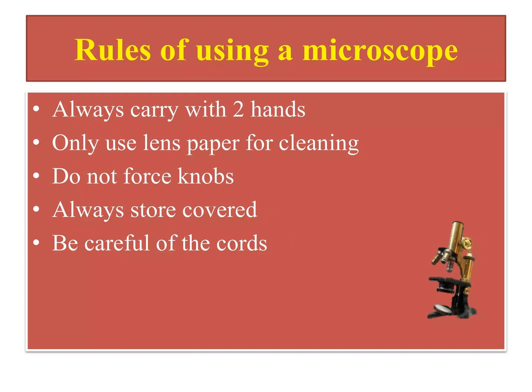Rules for using a microscope. Always carry it with two hands. Only use lens paper for cleaning the lens. Do not force the knobs. Always store it with the cover on. Be careful of the cord.